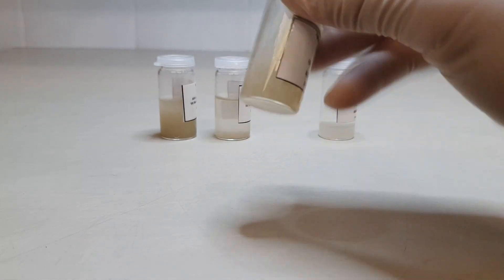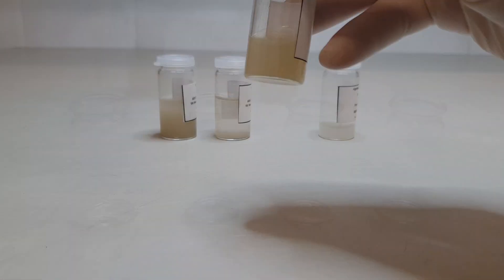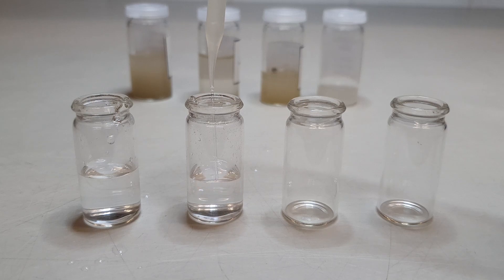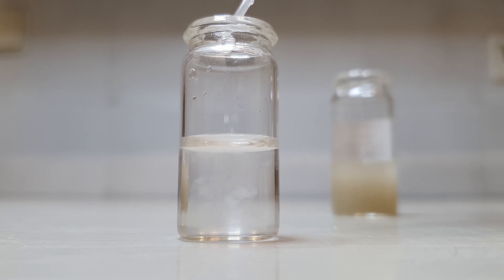The cleaned diatom suspension is too concentrated for mounting and therefore needs to be diluted first. Prepare a glass vial filled up halfway with distilled water. Homogenize the diatom suspension with a pipette and transfer a few drops of the suspension to the glass vial. The diluted suspension should be only slightly milky, with fine particles being just visible when held up to the light.